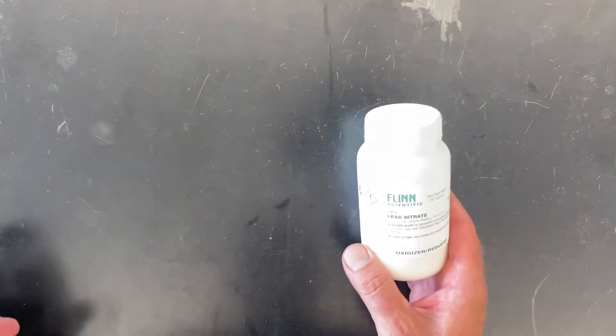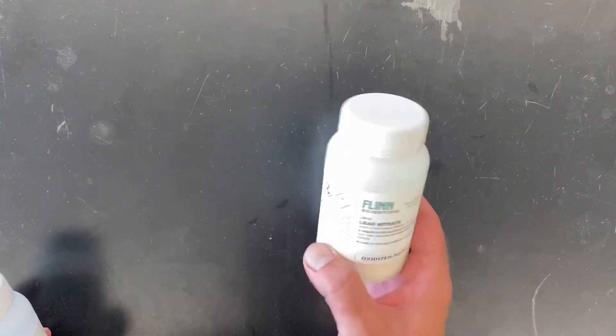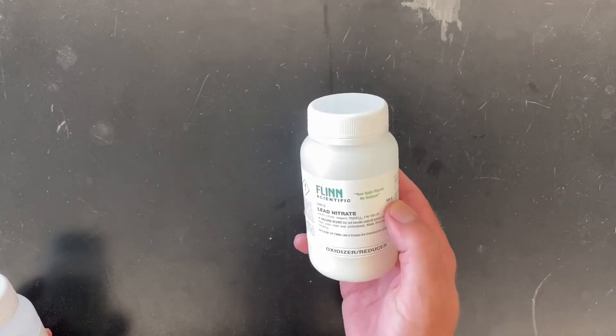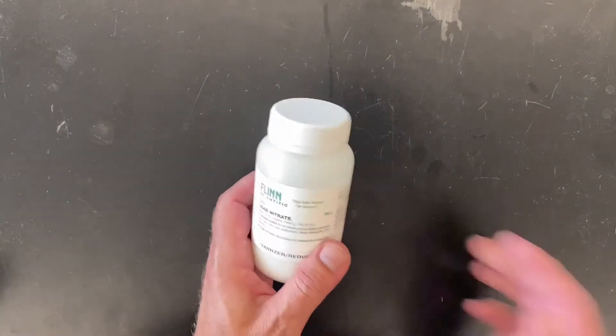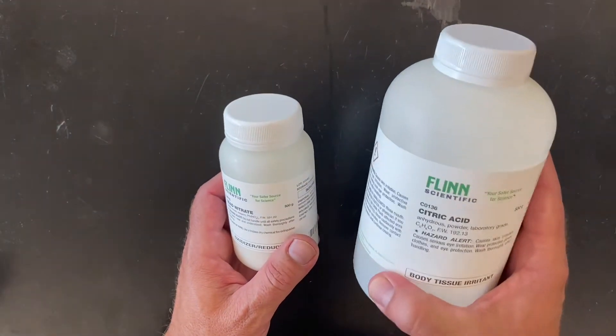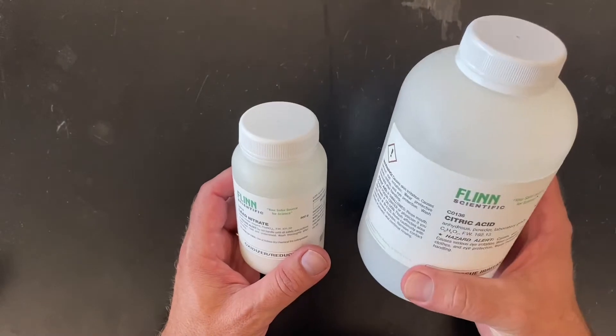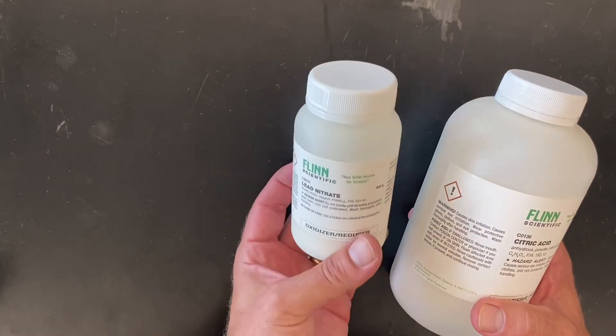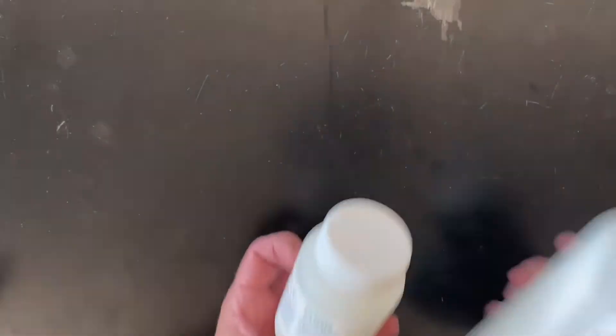We have some lead nitrate, which comes in a smaller bottle but is actually surprisingly hefty — this is a 500 gram bottle of lead nitrate. For comparison, this is a 500 gram bottle of citric acid and it's much bigger. The lead nitrate is much more dense, so you get a lot more weight into a smaller volume.